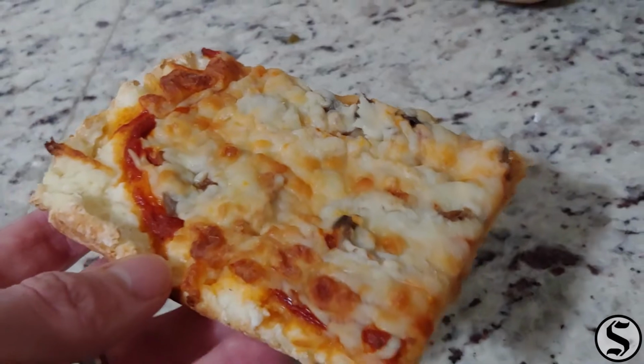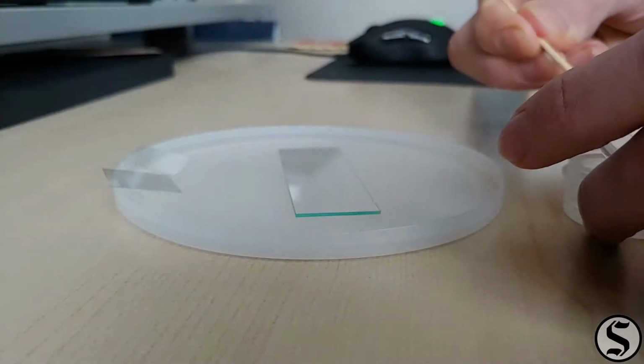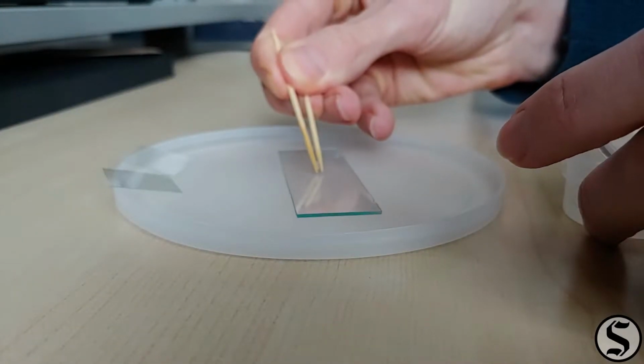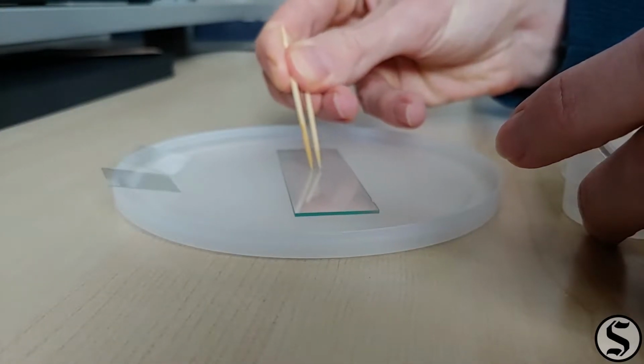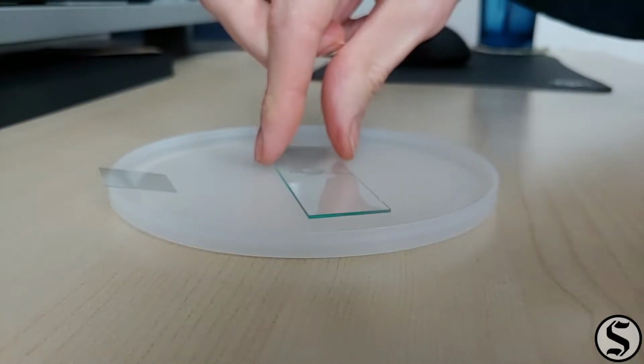Today's sample comes from my pizza, specifically the dough. More specifically, the yeast that went into the dough. So I mixed that yeast into a little warm water, put a few drops on a slide for us to investigate.